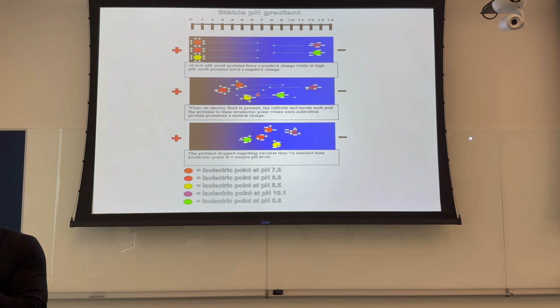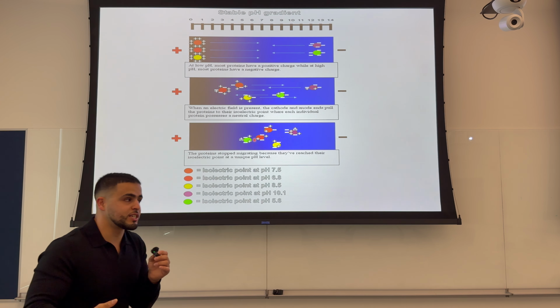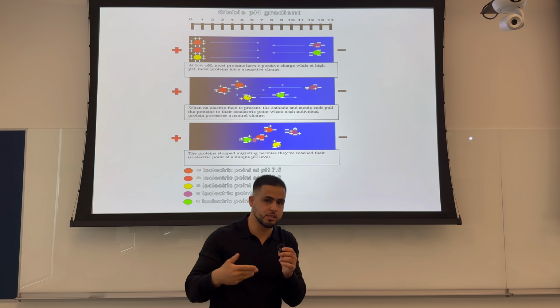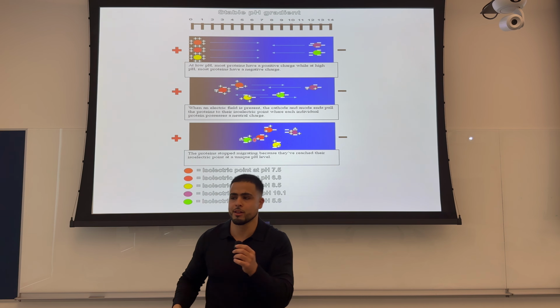So for example, here they can ask me, what is the PI of this green protein? I look at where it stops, around 5, so 5, and you can see it over here, 5.6. So you can infer based on that what the PI value is. Another question they can give you is, what type of amino acids are most abundant in this protein? Well, you probably have more acidic amino acids in this protein compared to basic ones, and that's why its PI was on the lower side.